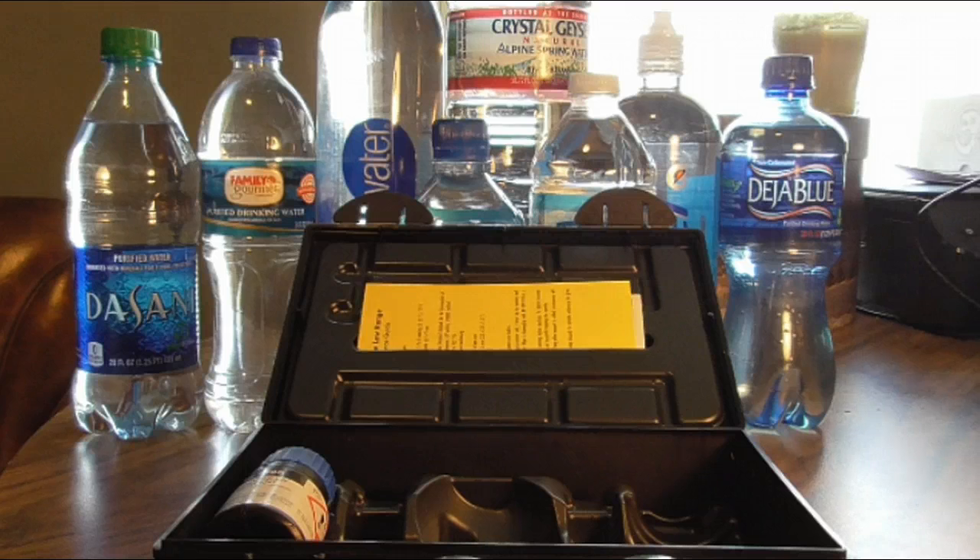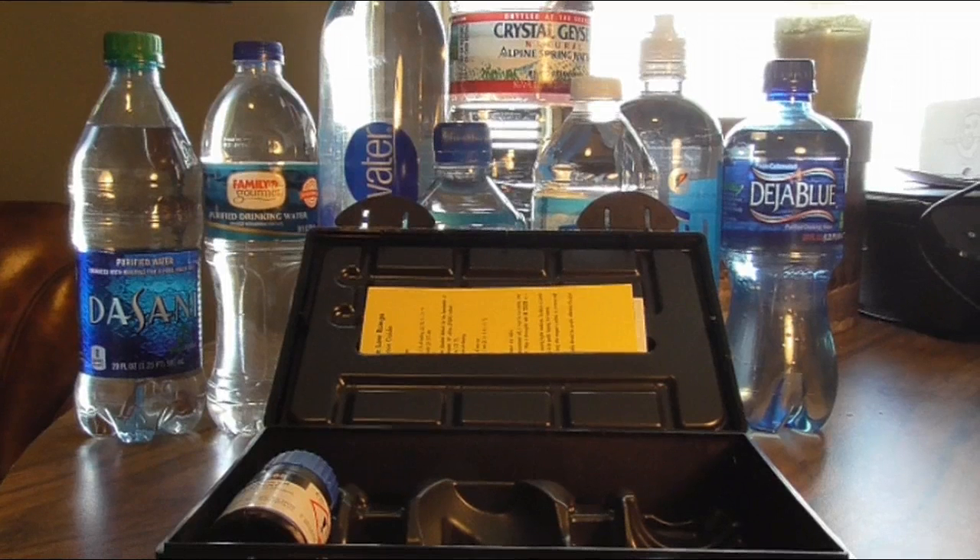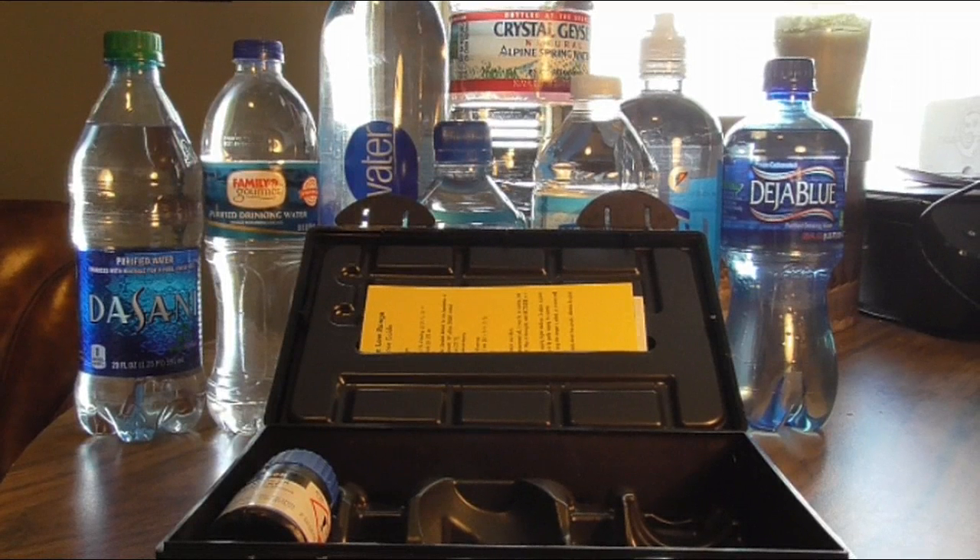So how this works — it's rather time consuming per each test — but I'm going to show you the rundown on one and then show the test results for each one as well, the end number for each water that I'm going to test here. I've got eight of them, popular brands. I'm also going to test every city I go to from here on out.